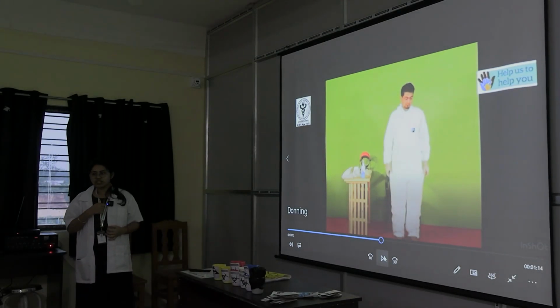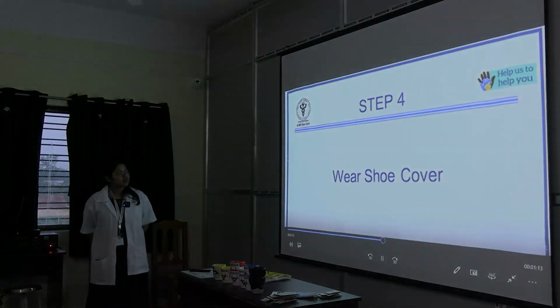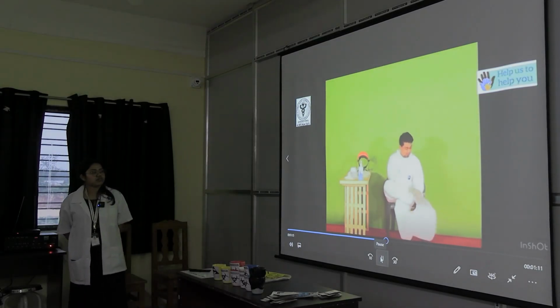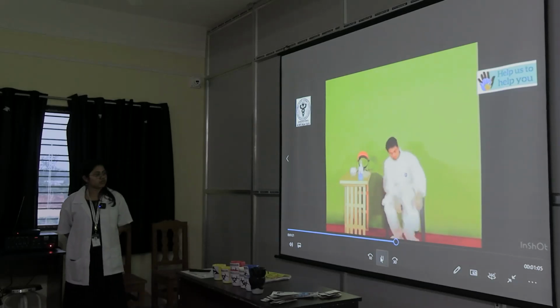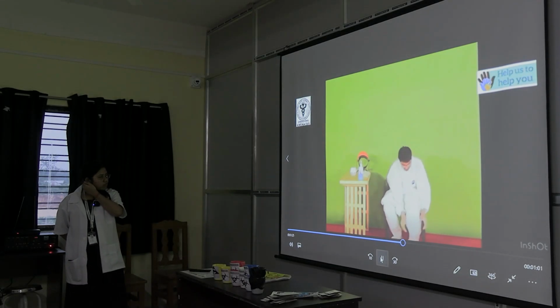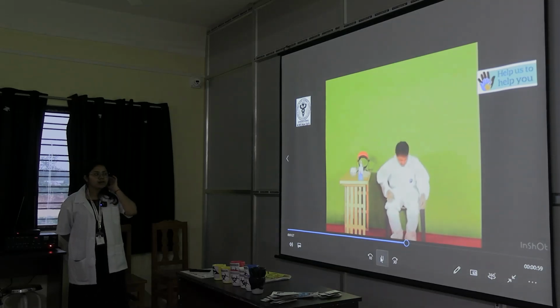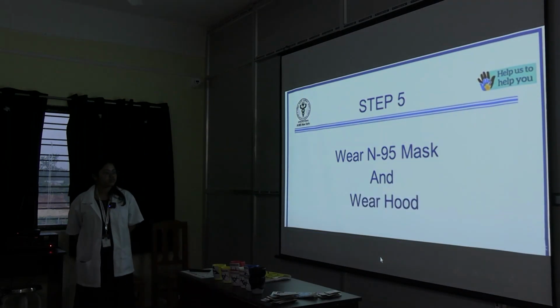After closing the zip, you will put on your flaps over the zip. Okay. Now he is wearing the shoe cover.